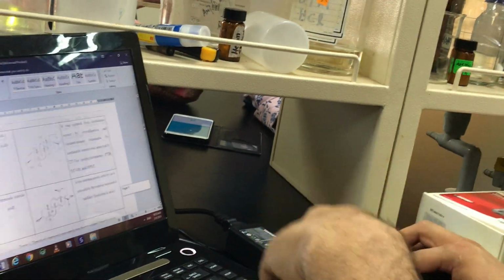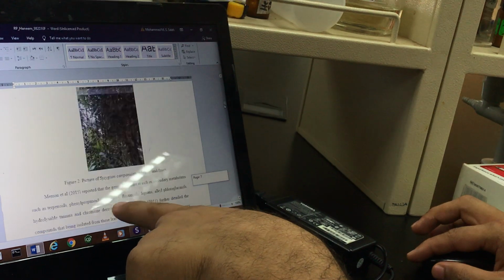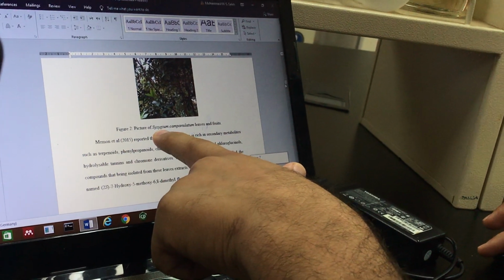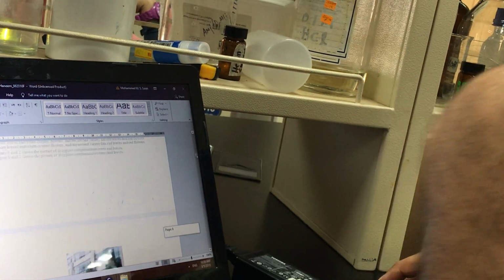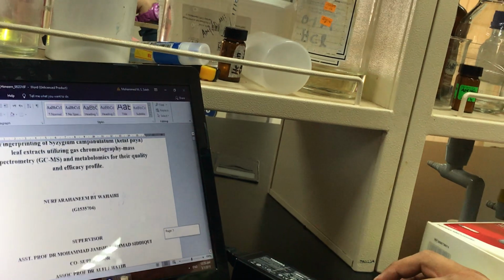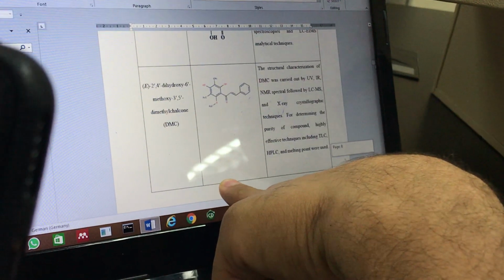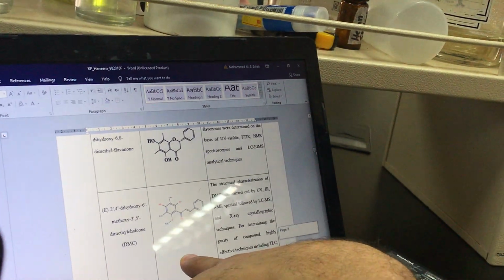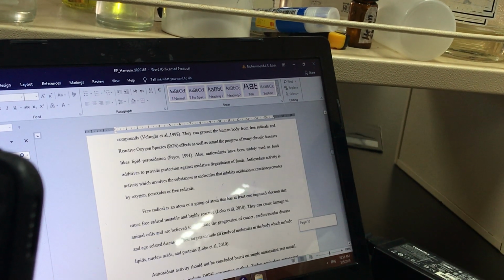This is all about the plant. You can see even the metabolites. This is the plant, I'm sure, because this is the proposal. These are the metabolites available, very easy here, all the metabolites. Can you email it? Terpenoids, yes.